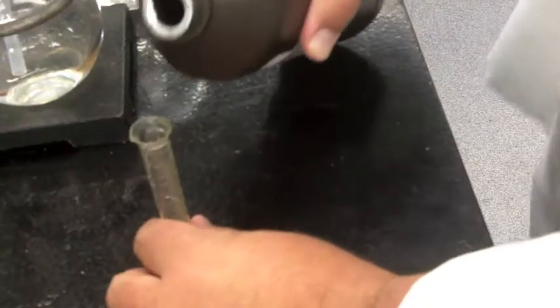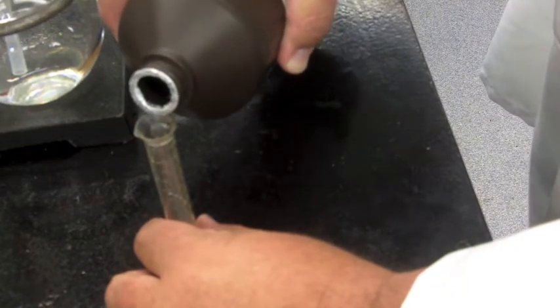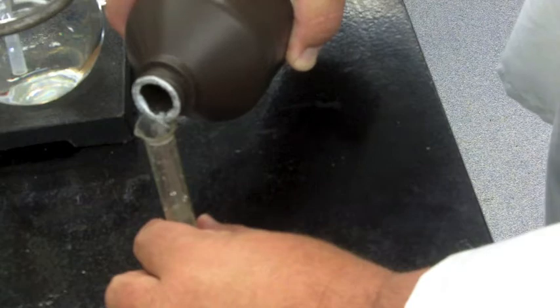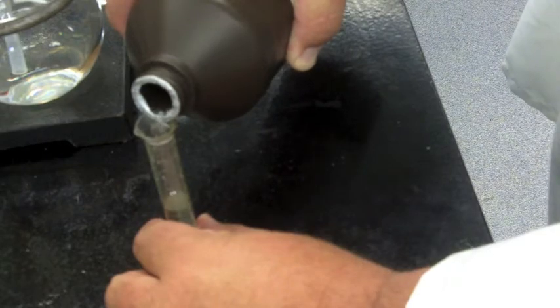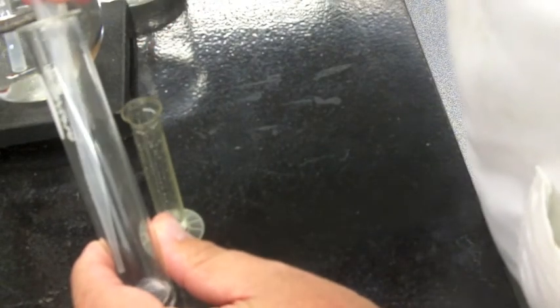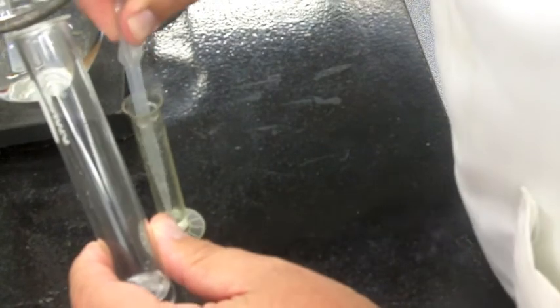Now at this point you're going to measure out 10 mL of hydrogen peroxide, and it's not important that you get exactly 10 mL. The main thing is that you know exactly how much you have. Then we're going to transfer this to a large tube, which will be given to you as part of the device. We really want to make sure it's at the bottom of the tube, so I would use a pipette to make sure it all gets transferred.